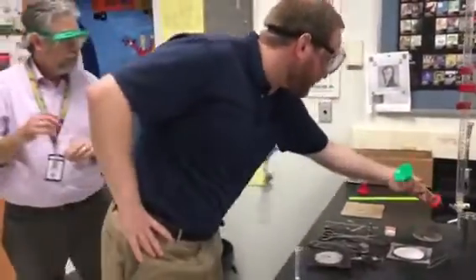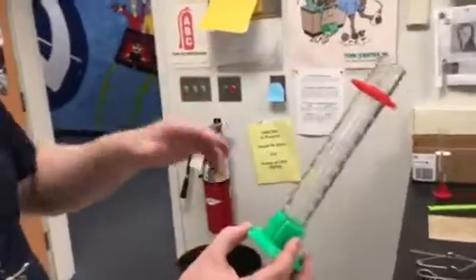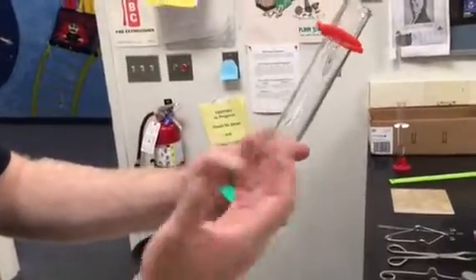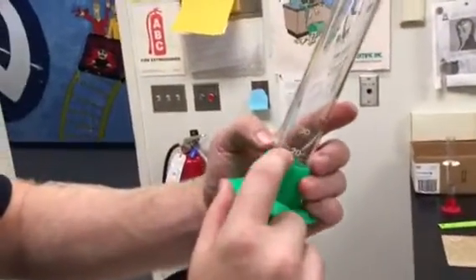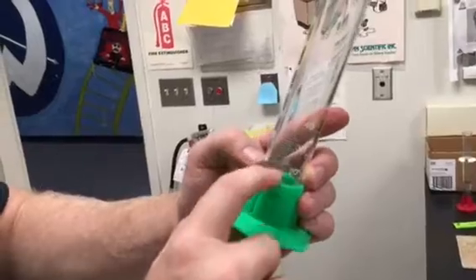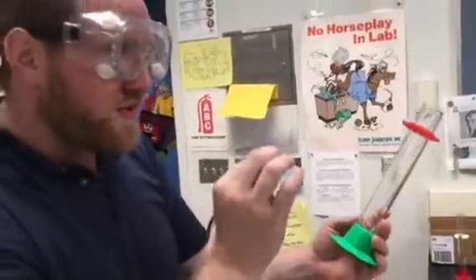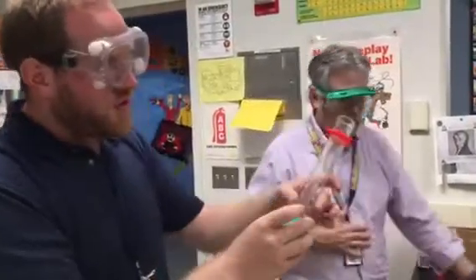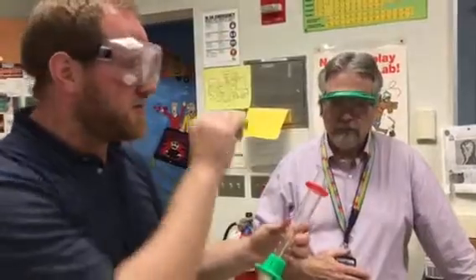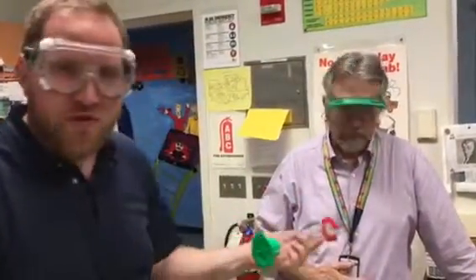It's even worth it, when you first pick up your piece of glassware, if I'm going to be using this to measure, let's say 10 different things, you can just look at this and judge how much you're going to read, how many digits each one's going to get. So looking at this, let's see, I have 20, 30, 10 lines in between. These are milliliters. So every single number I measure with this is going to be one step beyond the ones or the tenths. So every single reading I get with this is going to be some number point something, so 1 decimal place. And then you could just remember that for the whole lab.